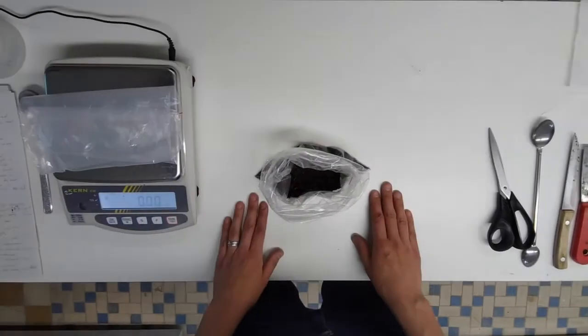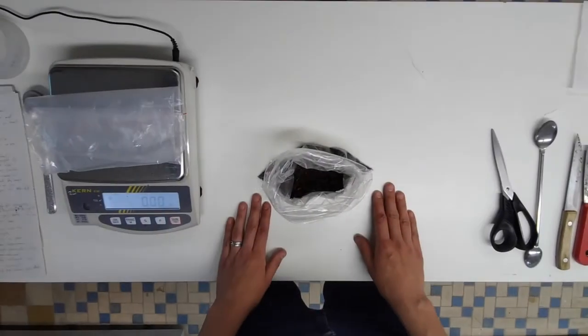We use half of the 5cm soil core collected for wet extraction to extract nematodes and another half to extract enchytraeids, which is covered in another video.